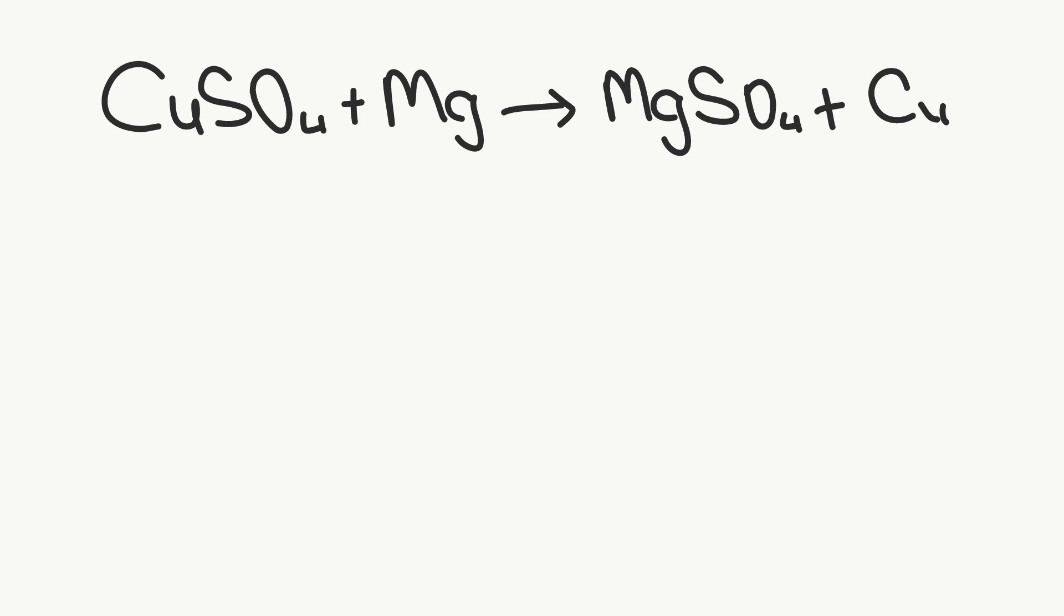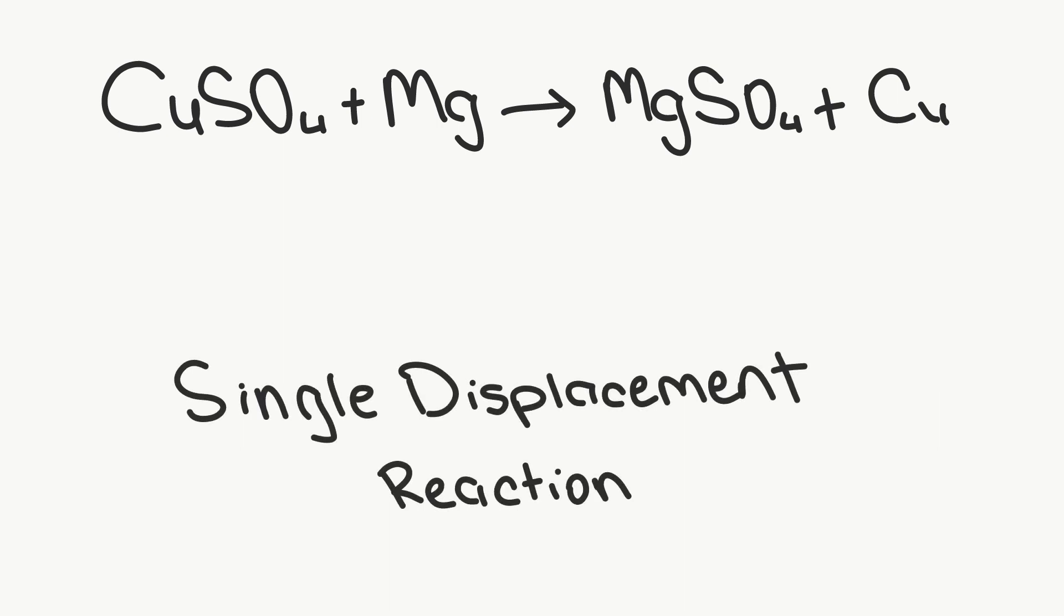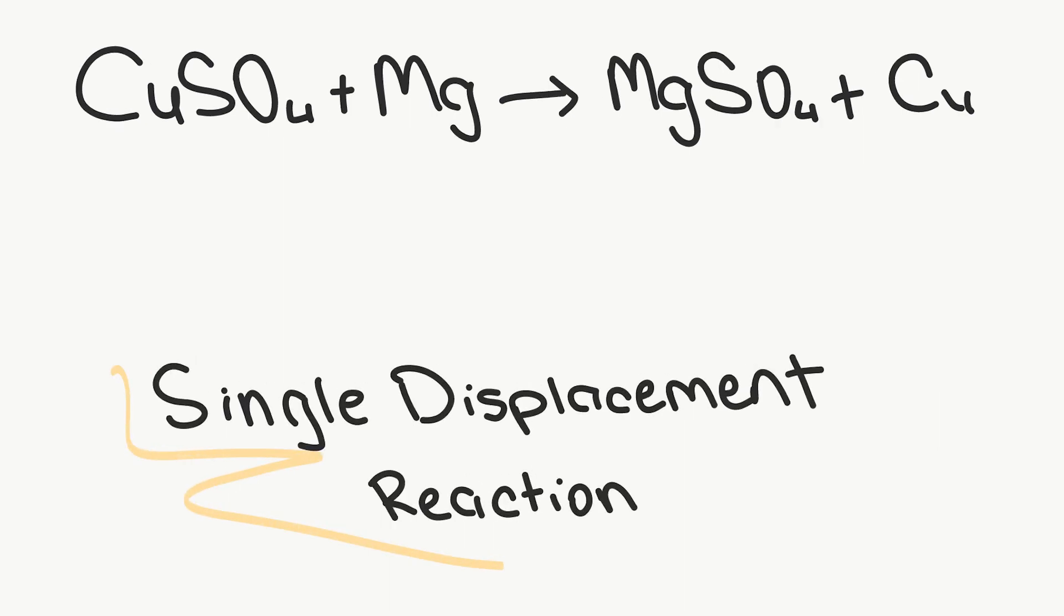This is the reaction of copper 2 sulfate and magnesium metal. As you can see, the magnesium replaces the copper, therefore this is a single displacement reaction.